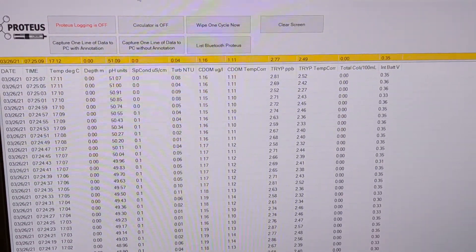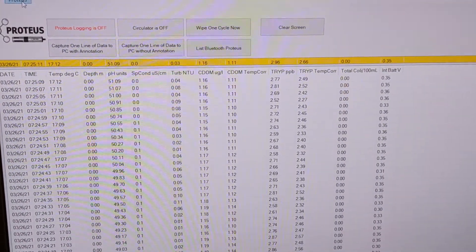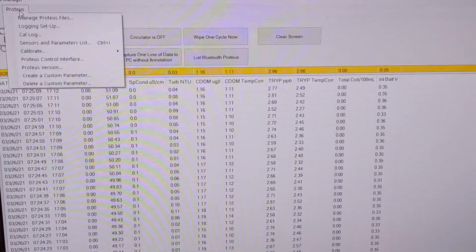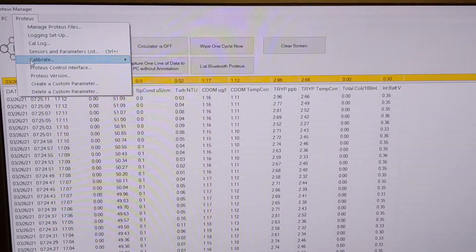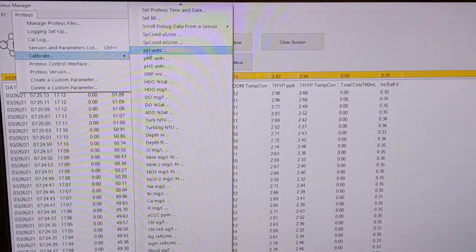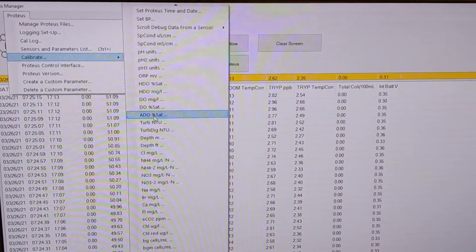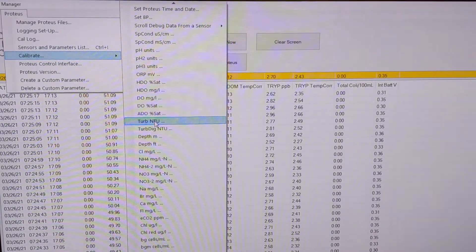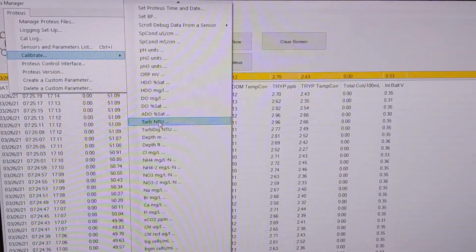We're going to calibrate turbidity. To do this, you go to the Proteus drop down menu here, go down to calibrate which brings up a list over here, and then you select the parameter that you want to calibrate. In this case, it will be turb NTU.